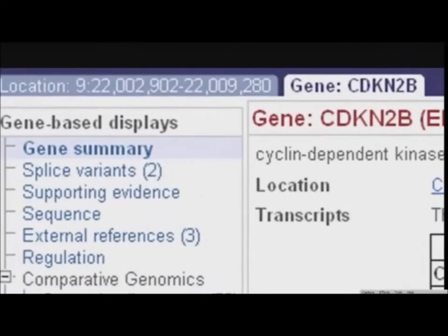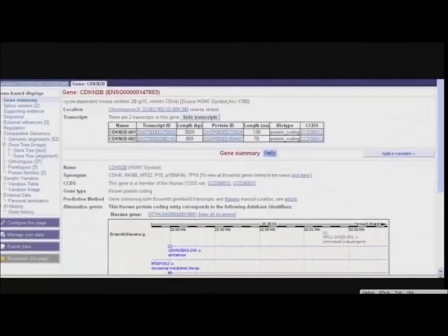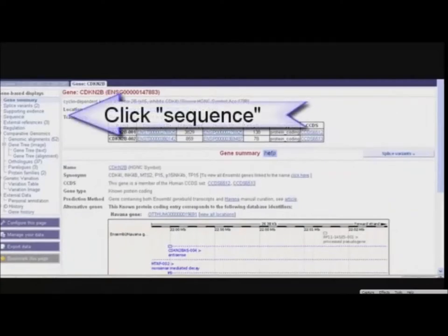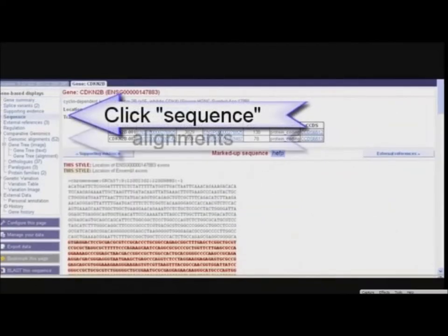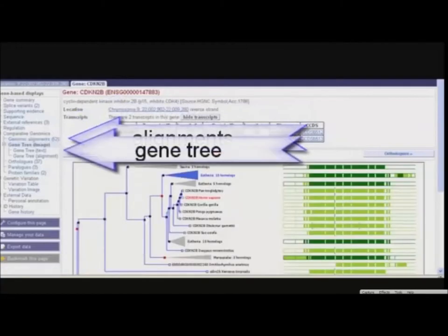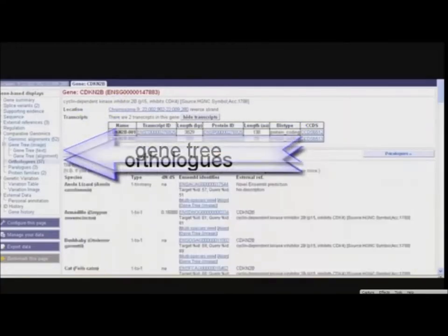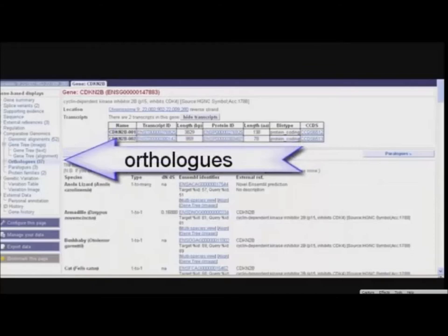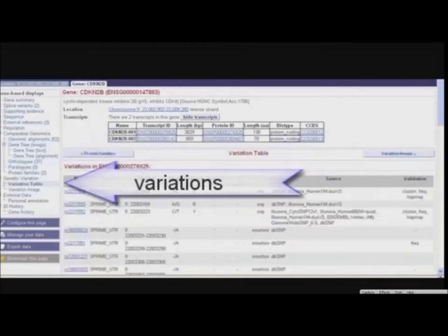The Ensembl views are separated into tabs. We are in the Gene tab. Links at the left show specific information for the CDKN2B gene — for example, genomic sequence, sequence alignments, a gene tree, homology relationships, and variations.